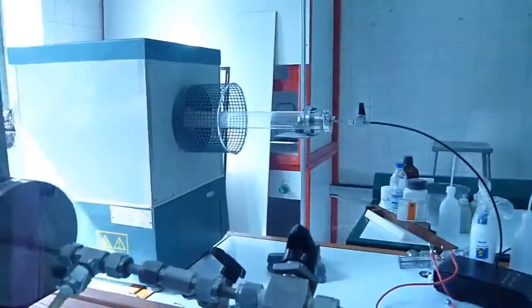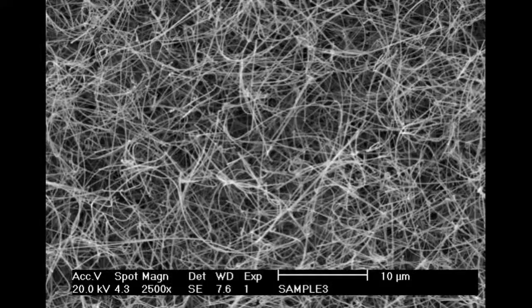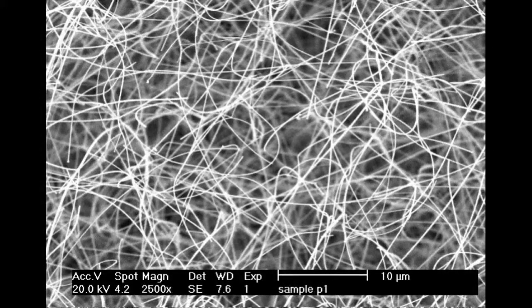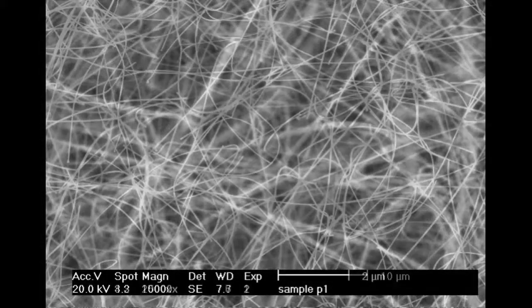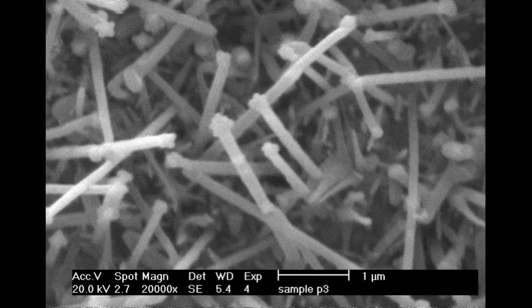Microfabrication processes widely use chemical vapor deposition to deposit material in various forms, including monocrystalline, polycrystalline, amorphous, and epitaxial. These materials include silicon such as SiO2, germanium, carbide, nitride, and oxynitride, carbon such as fiber, nanofibers, nanotubes, diamonds, and graphene, fluorocarbons, filament, tungsten, titanium nitride, and various high-K dielectrics.